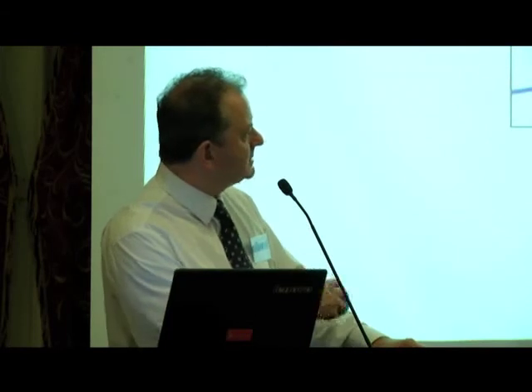The other issue we have with calibrating on site is getting a TOC standard that's stable below this sort of level is very difficult. So we cannot really make standards to this level. It's just almost impossible to have a stable standard.